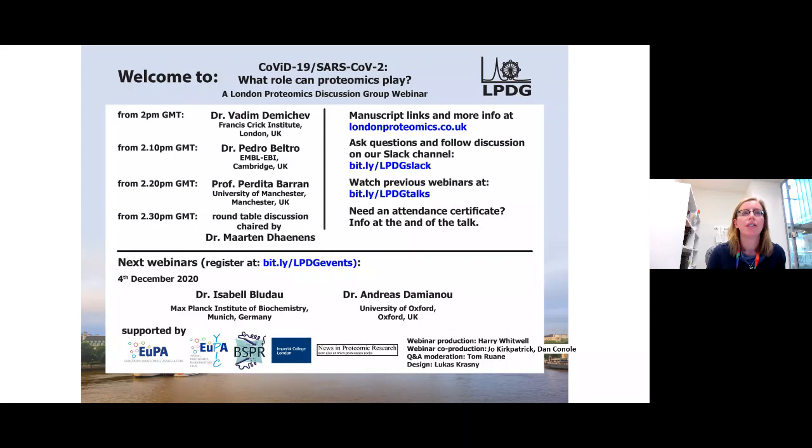So first of all, I'm going to introduce the first of today's speakers, and that's Dr. Vadim Demichev from the Francis Crick Institute in London. Vadim works on high throughput proteomics methods and their applications to large scale screening and disease profiling. The combination of DIA proteomics such as SWATH and scanning SWATH and DIANN, a neural network based automated software suite for data processing, allows a throughput of 180 samples per day in the mass spec while yielding good identification numbers and accurate quantification. Today he will update us on their group's ultra-fast proteomics pipeline for COVID-19 outcome prediction. So it's over to you, Vadim.